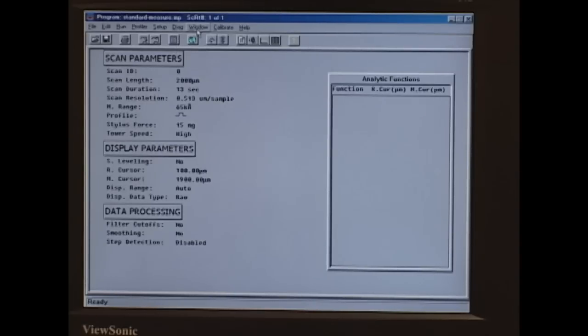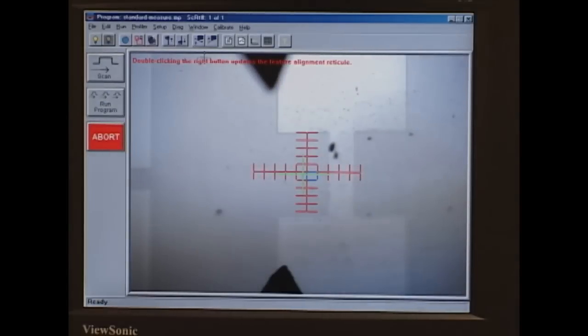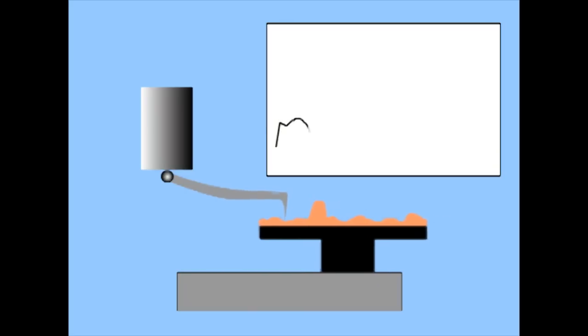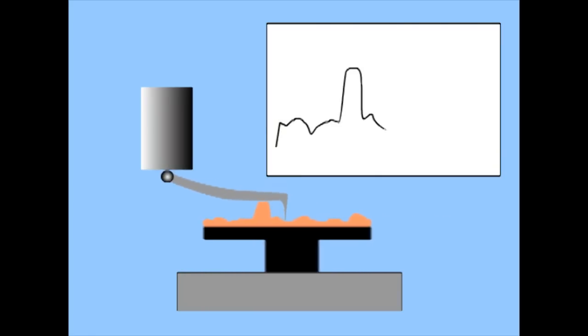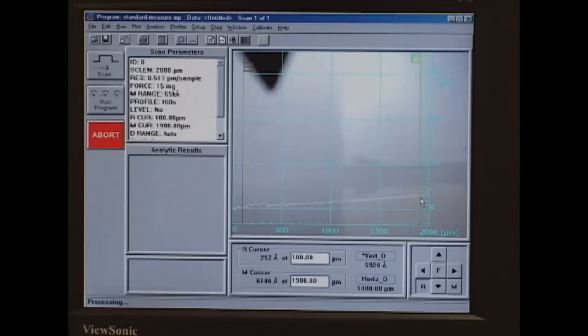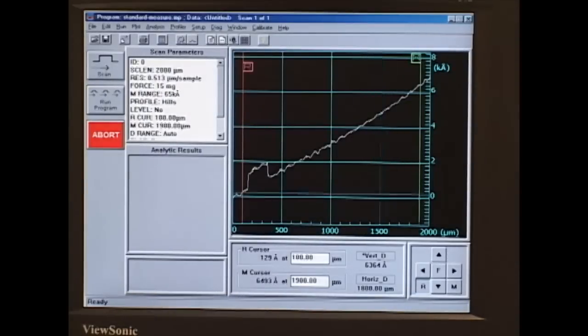So then we'll go back to window, click on sample positioning, and click on scan in the left side. And that will begin the scan. So in this box you can see in the background is the camera view of the scan actually taking place. And in the front is this graph that shows the data that's being acquired from the instrument. So the scan is complete. And now we just see the data.